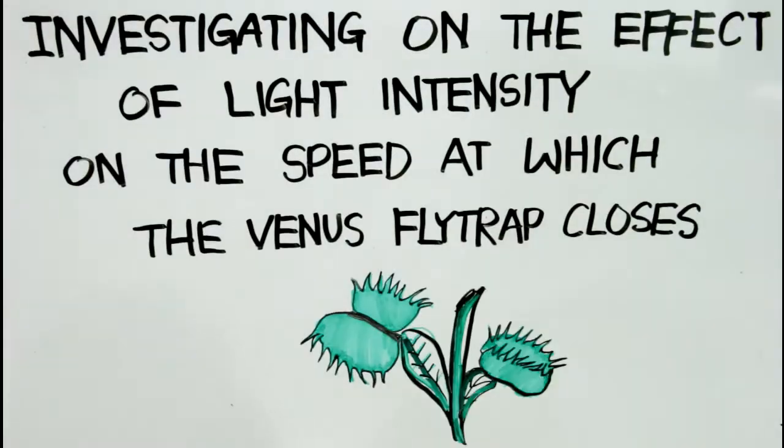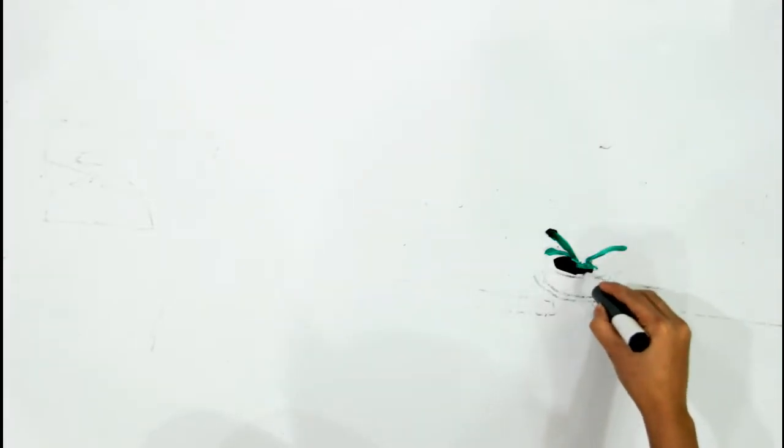To measure this, we set up in a completely dark room a lamp and the Venus Flytrap with a distance of 0 up to 200 centimeters apart. We only had access to 3 lamps and 3 traps, so we started off with 0, 50, and 100 centimeters for the distance between the plant and the lamp.